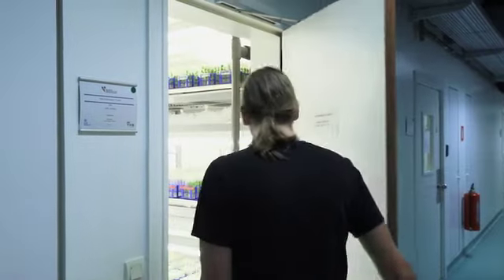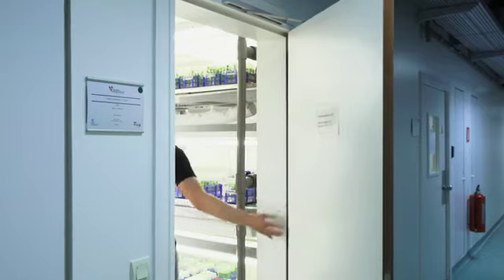When we want to design a guide RNA, we have a lot of different online tools to do this. In these online tools, you basically click on the genome of the species that you want to study. In our case, it's often Arabidopsis. And you paste your gene sequence or the region in the genome that you want to target in this tool. You click submit and you get a list of, let's say, 100 targets that are possible within this region. And then you get some extra scores. For example, there are some bioinformatic tools that rank guide RNAs, and so you can make a more informed choice if this could be a good performing guide RNA.